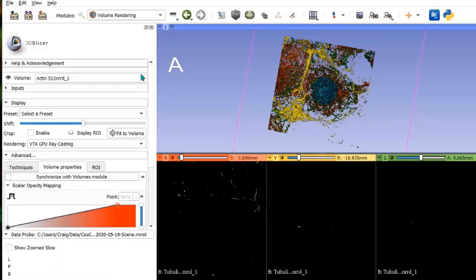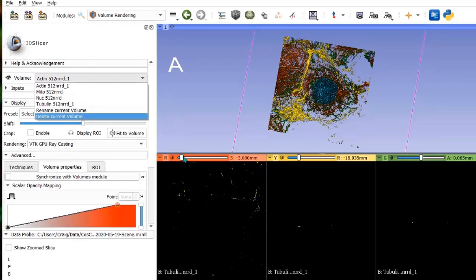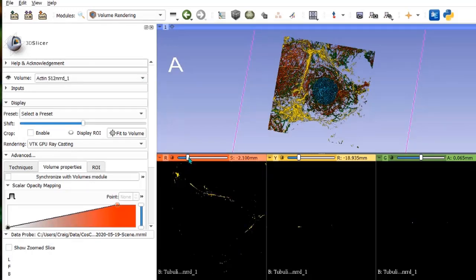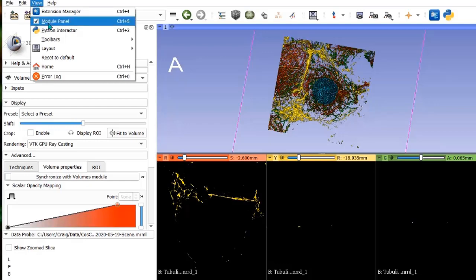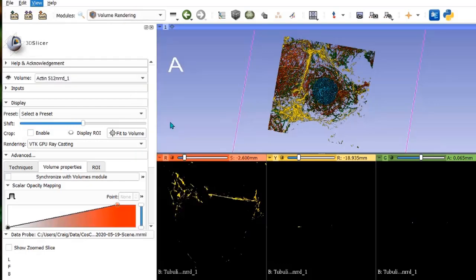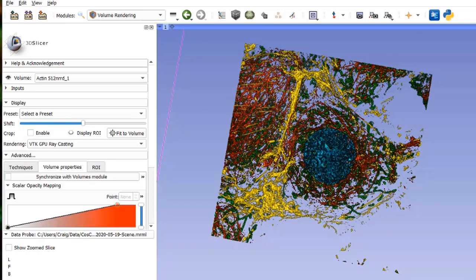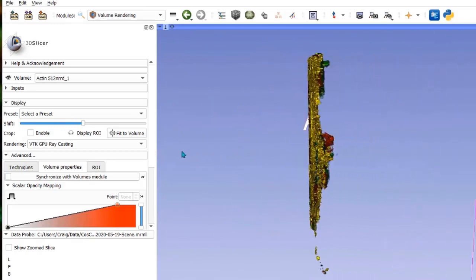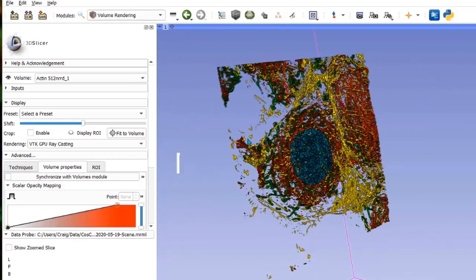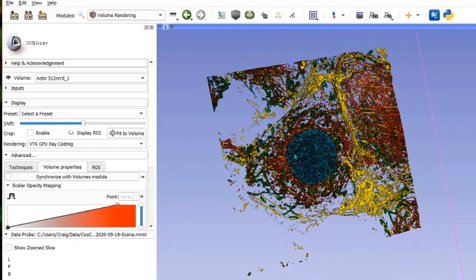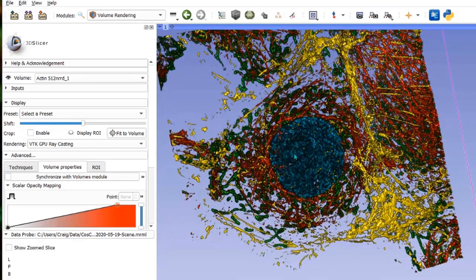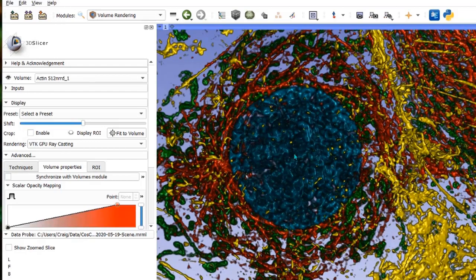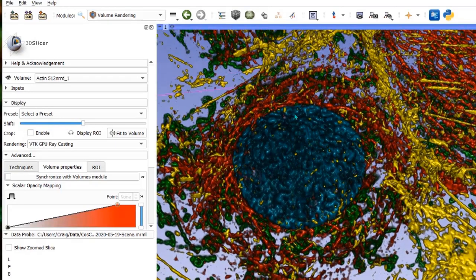The four channels are then imported into 3D Slicer and all four channels are shown here as volumetric renderings. We can see the rendering more clearly if we view in the 3D window only. You can get that from the layout menu. 3D Slicer does a pretty good job at rendering the four channels and it offers quite a few options for volume rendering. I'll probably make another tutorial specifically covering the volume module and volume rendering in general at a later date.